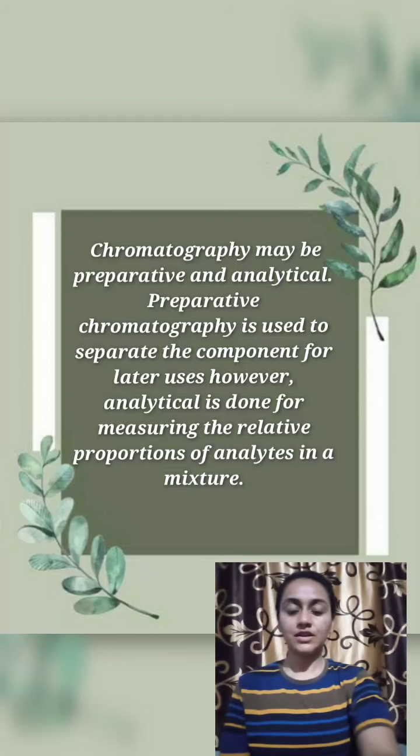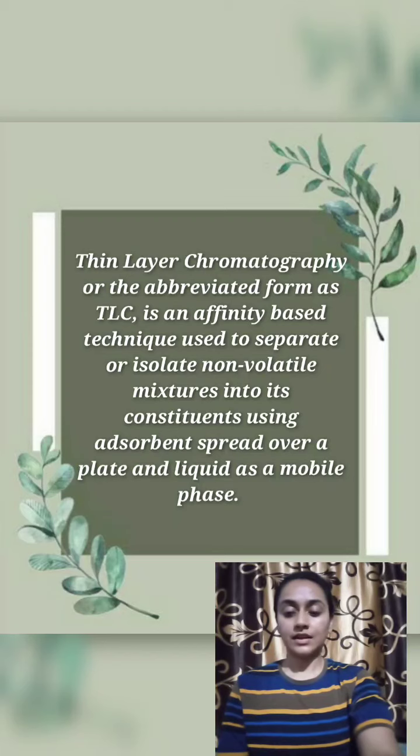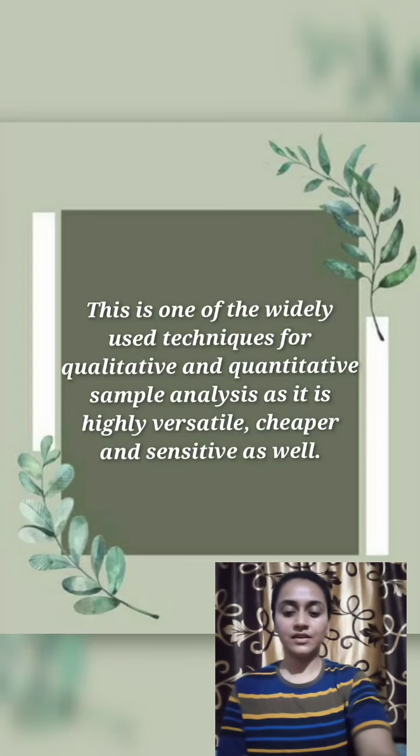Now let's talk about thin layer chromatography, or TLC, the abbreviated form. It is an affinity based technique used to separate or isolate non-volatile mixtures into their constituents using an adsorbent spread over a plate and a liquid as a mobile phase. This is one of the widely used techniques for both qualitative and quantitative sample analysis, as it is highly versatile, sensitive, and cheaper as well.